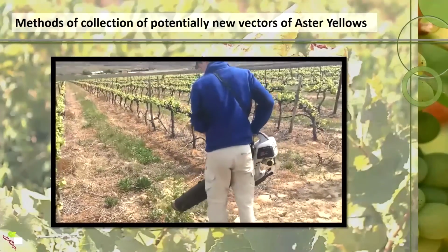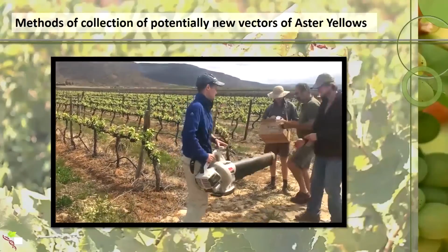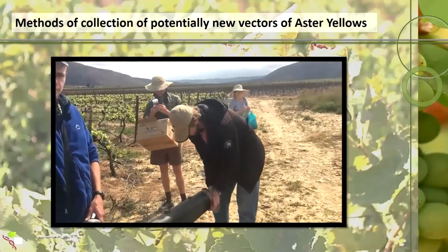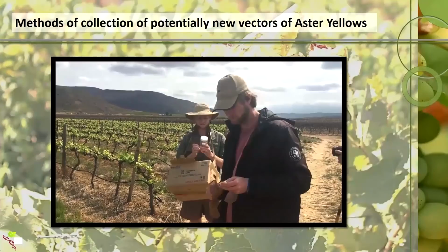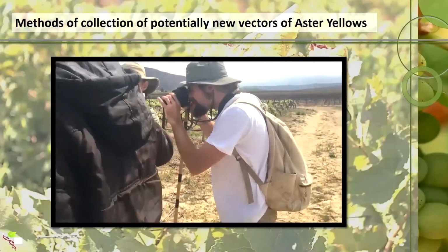taking mainly phloem-rich material and then placing that into a labeled plastic bag. Now to collect the insects, this is using the DVAC. It's basically a leaf blower which has been inverted so that it sucks. We have a stocking at the end that's taken off with all the contents that have been sucked up.